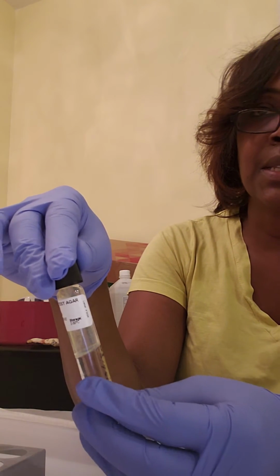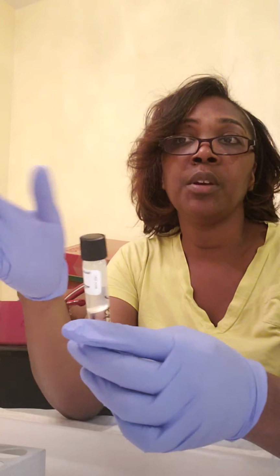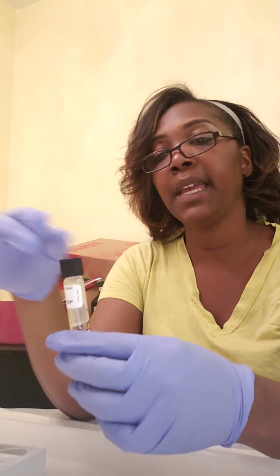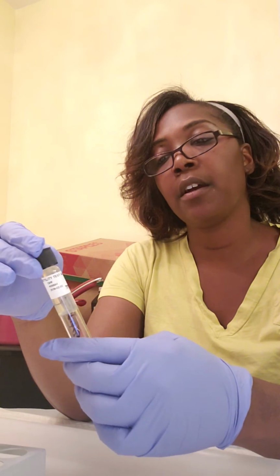And this helps, like I said, the purpose of this exercise, or the purpose of functional media, is to determine the identity of unknown microbes in a different type of form than just on my plate. Here I have a special broth, which is the motility test agar.